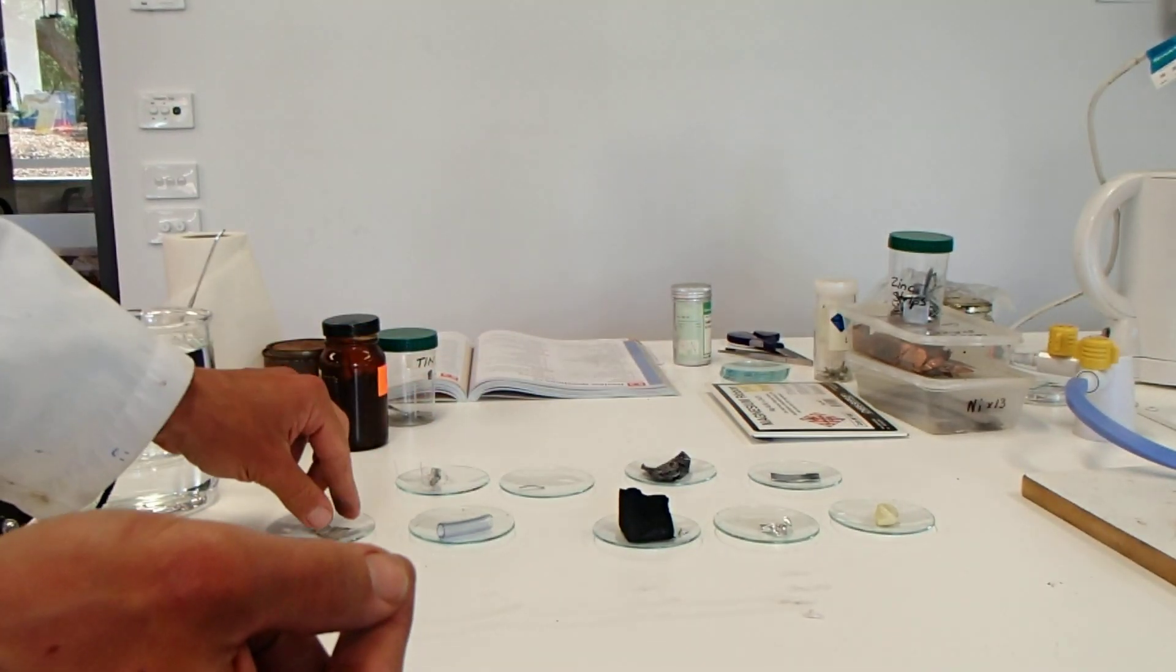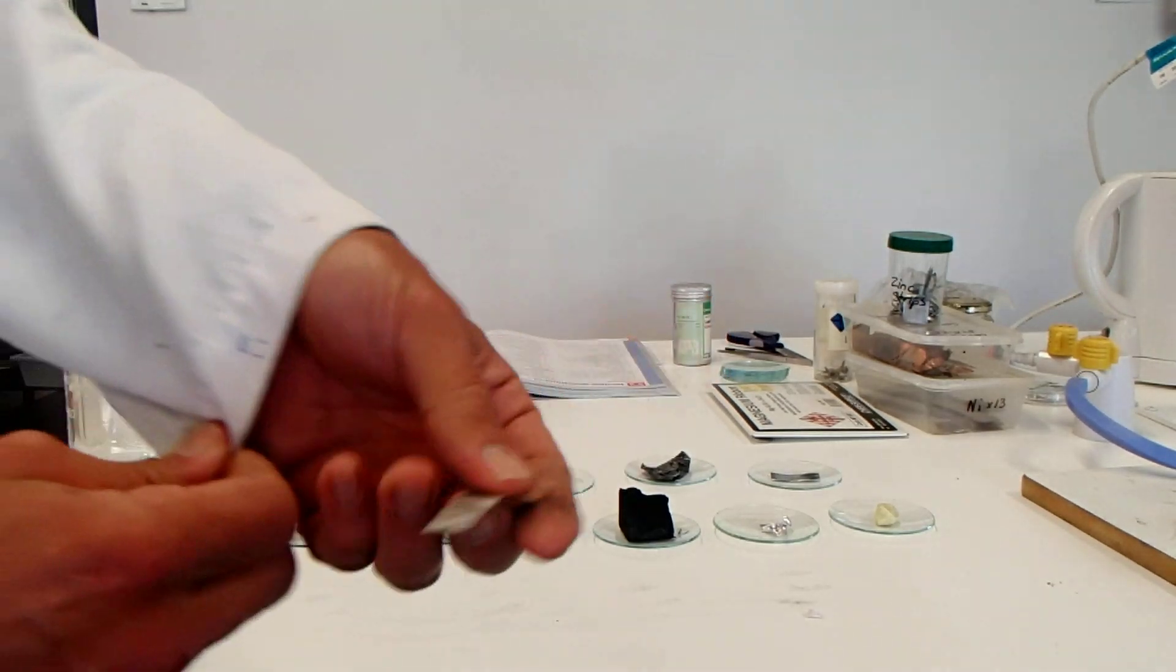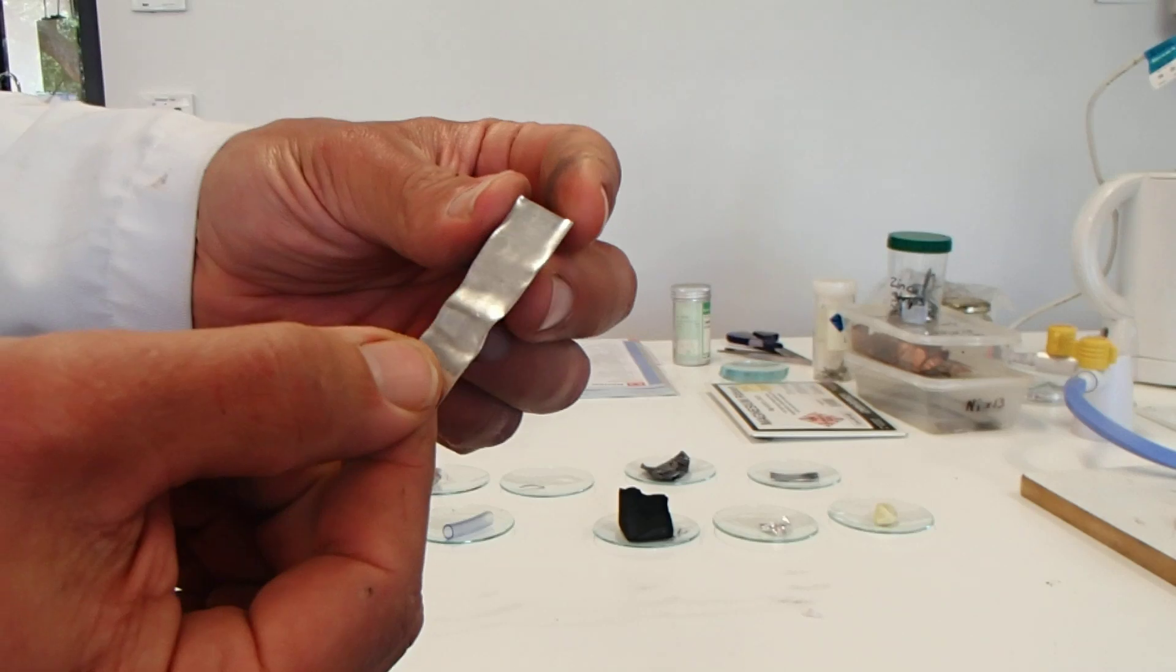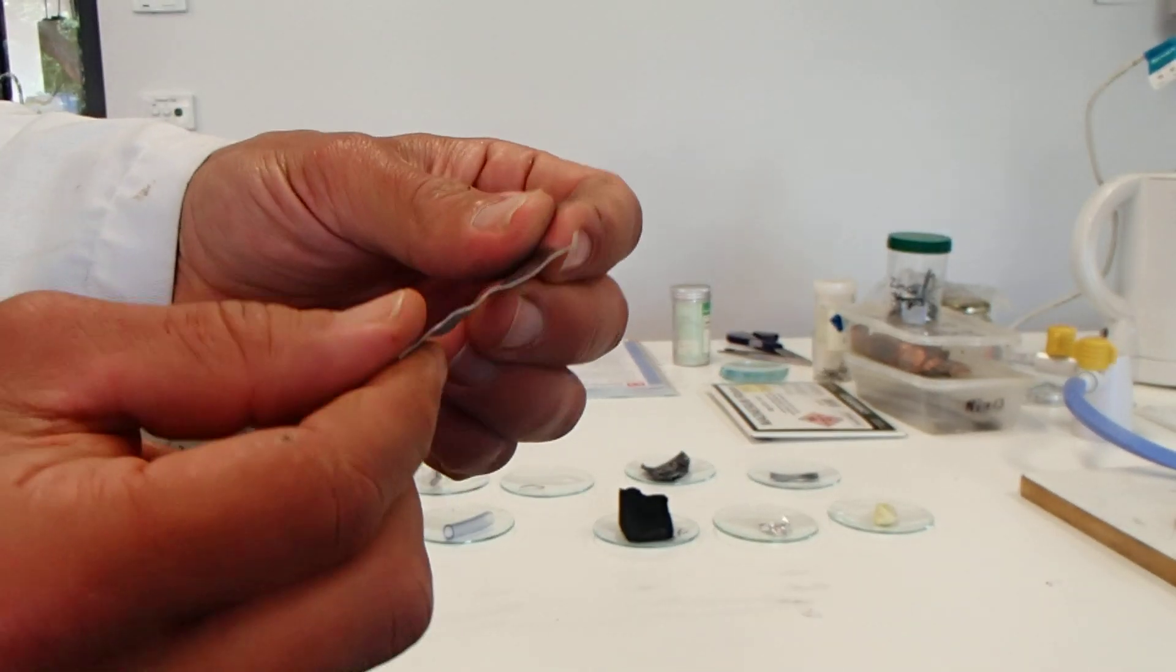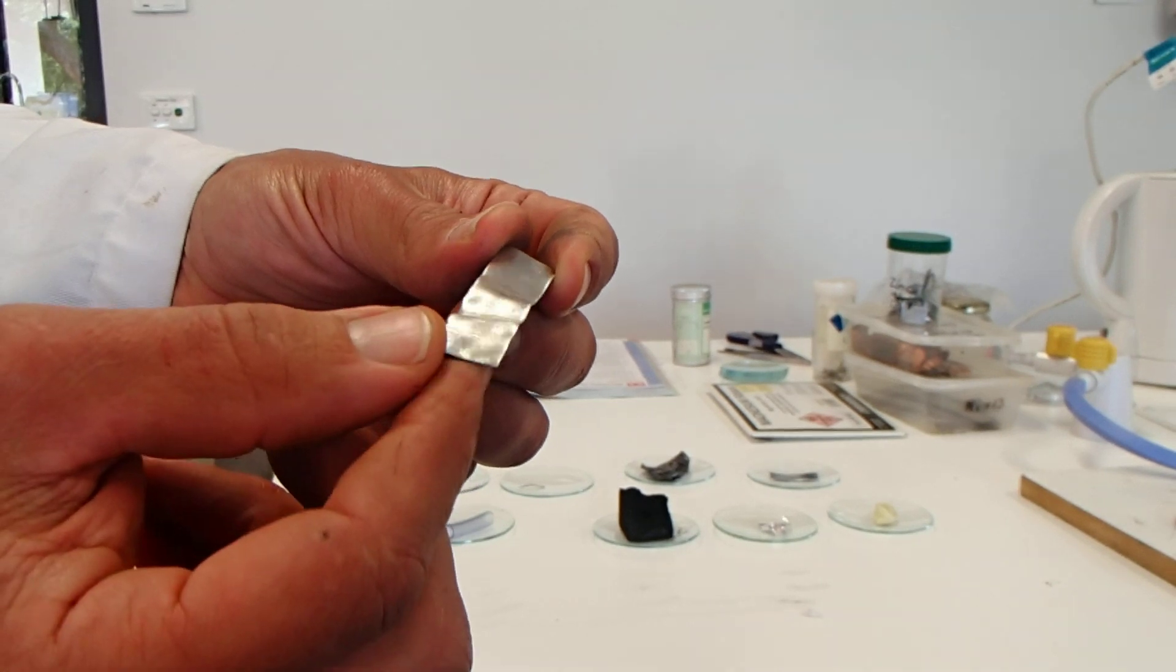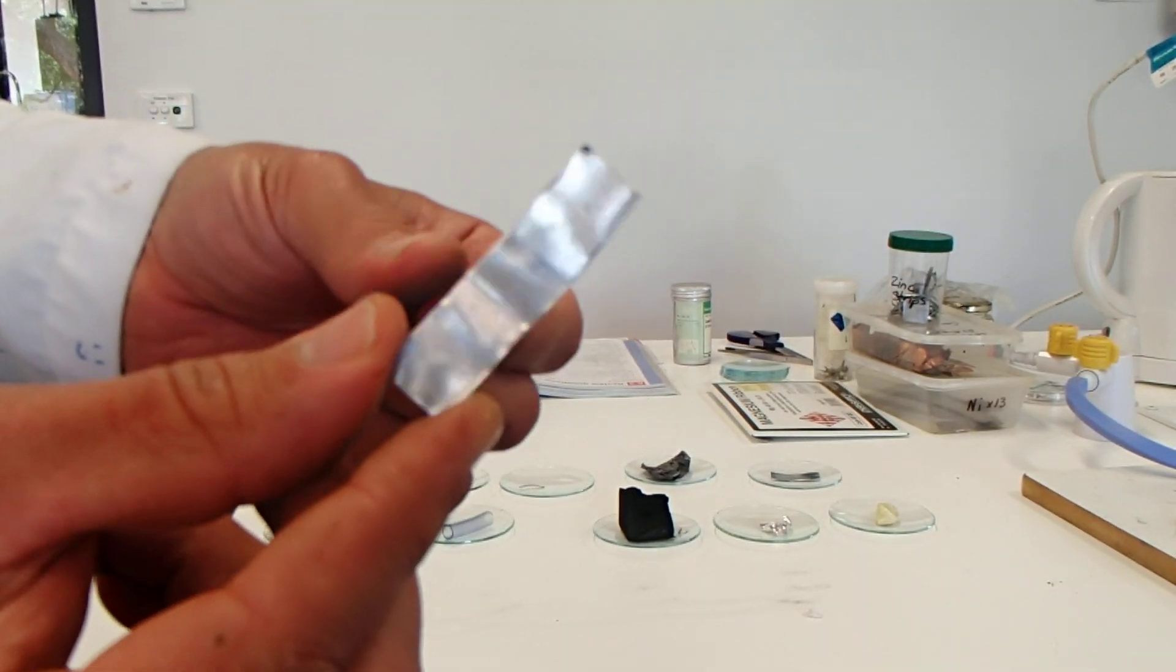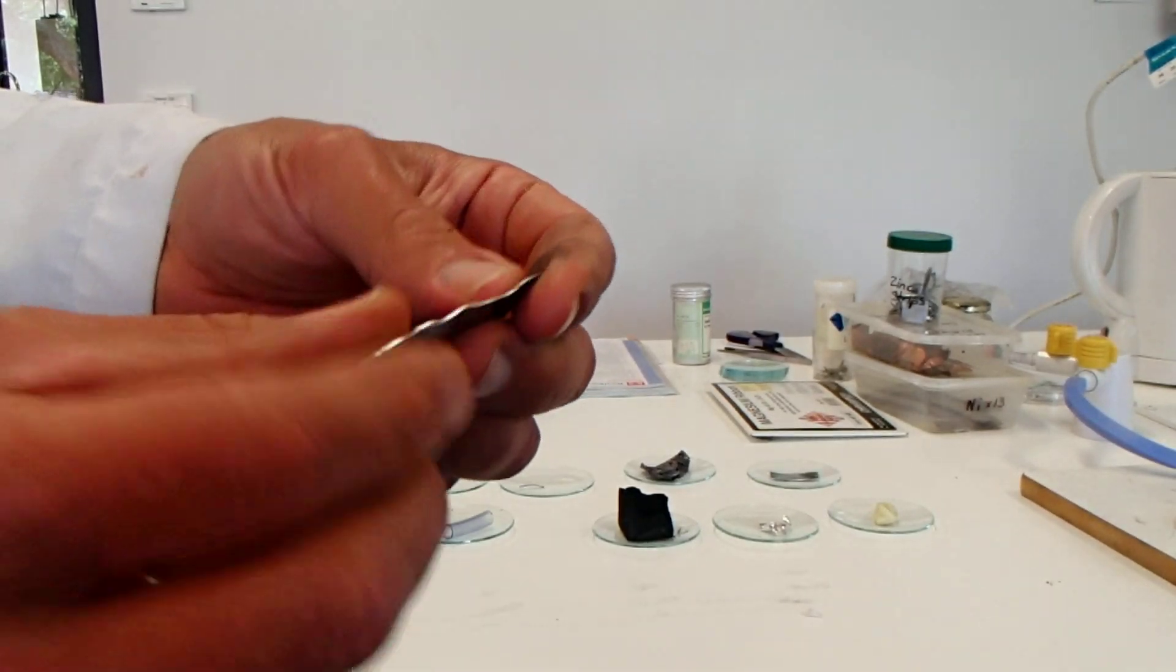Next we have tin. Looks like a classical metal, shiny but not super shiny, quite light, silver in color. So that's tin, quite smooth.